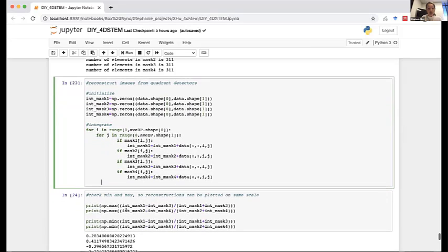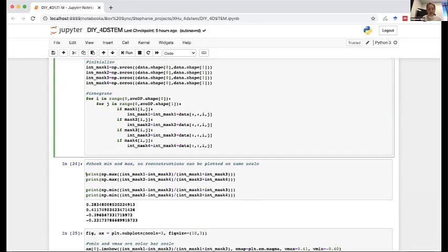And then what we're going to do is plot 1 versus 3 and 2 versus 4 and normalize. What I'd like to do to make it clearer what's going on is have 1 versus 3 and 2 versus 4 plotted on the same axes, so the color scale in each of those are the same. There could be fancier or better ways to do it, but I'm doing this manually.